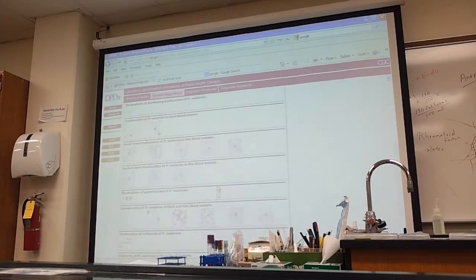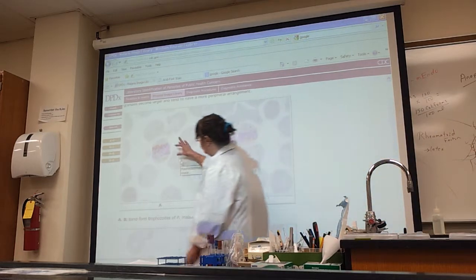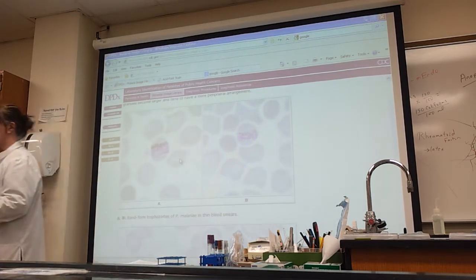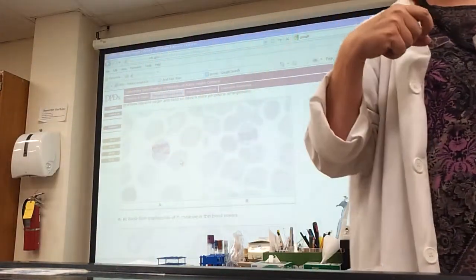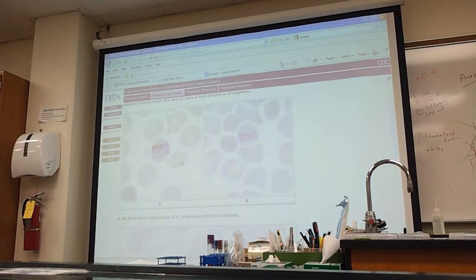So I'm not going to go for the ones we don't tend to see as much. This is Plasmodium. This is the band form. Band form. And of course, look, he can keep growing until he does what? Fills up the whole red blood cell. The other 2 forms can be ring and basket, like you carry a basket. Now, I'm not going to make you learn the 4 strains. Plasmodium is enough for me.